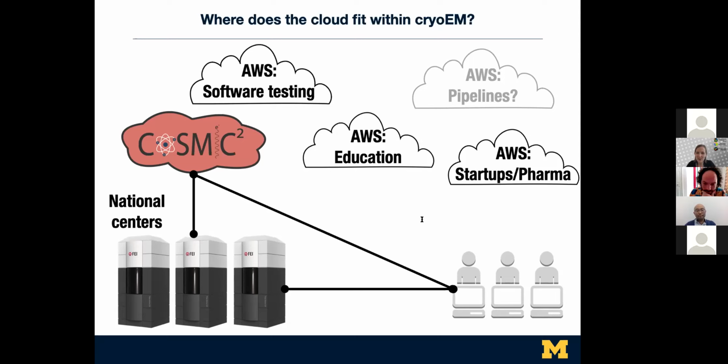And there are a couple questions about data storage in terms of how much you can store and for how long. And I'm not sure if these are directed particularly to the Cosmic use case or the general case. For Cosmic 2, because we have a finite amount of backend storage, at some interval we will remove all data. Right now it's every 3 weeks, but we can change that. It's mostly just making sure we don't fill up our hard drives full of people's data, but we could change that number if people have a use case or a reason to.